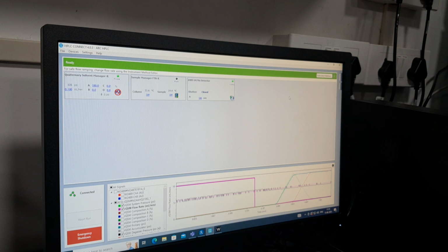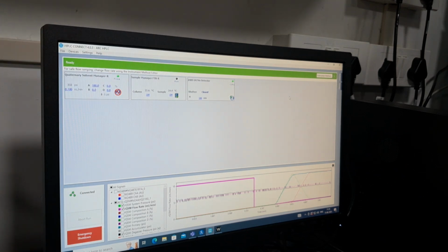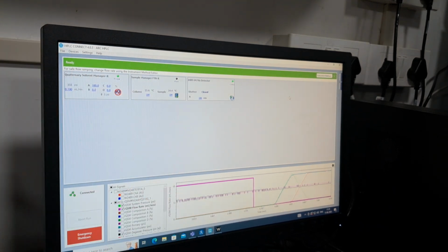Yes. Now the thing is, at that time this instrument was on. We kept it on power mode. Yes, it was on. It showed that failure, right? Yes. Okay. No, it was on.